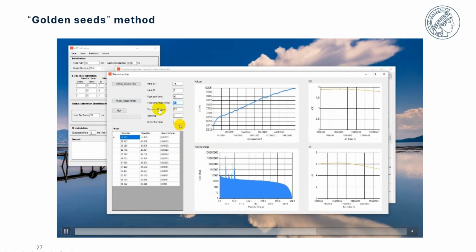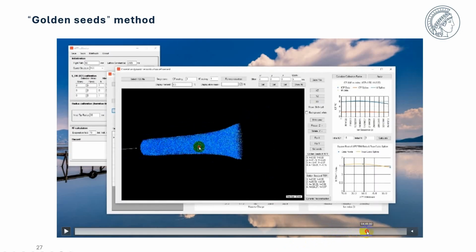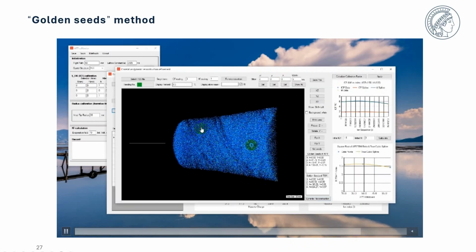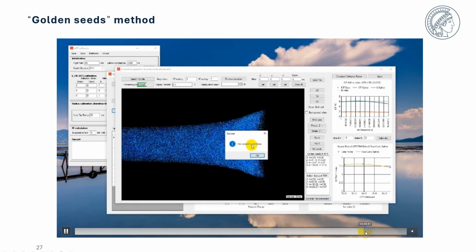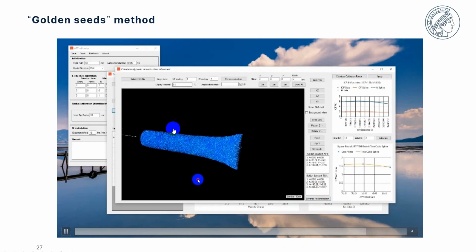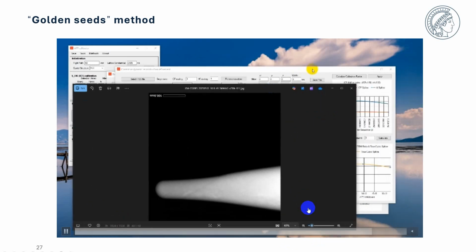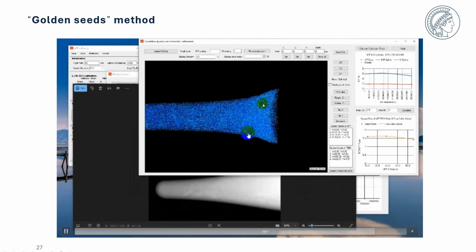Set an initial KF and ICF, or you can neglect it if you have the curve here. So now, after reconstruction, you will see a new result that is better than the result before.